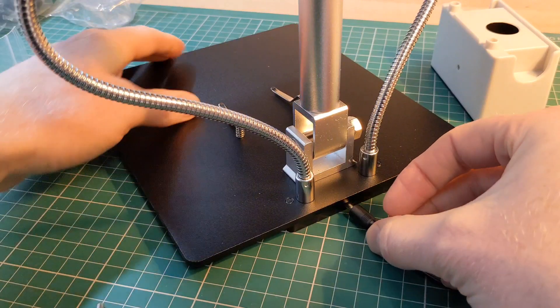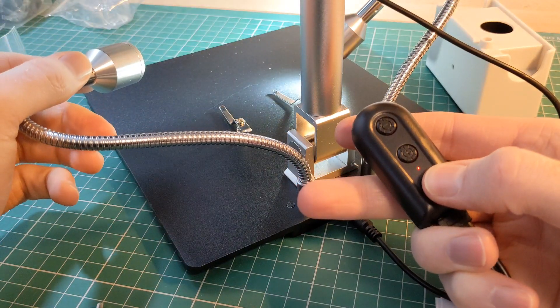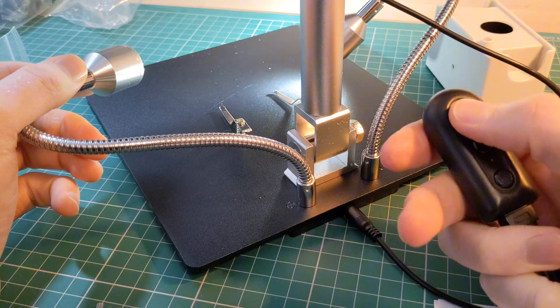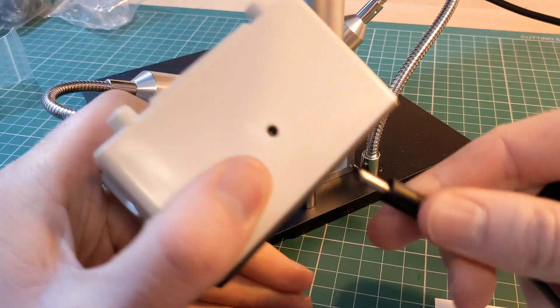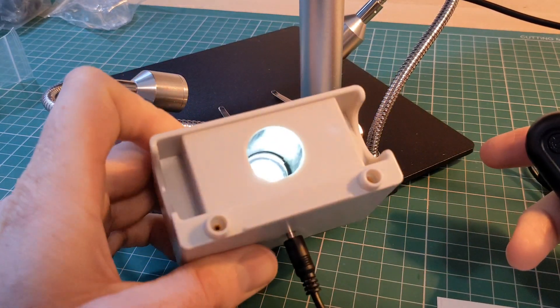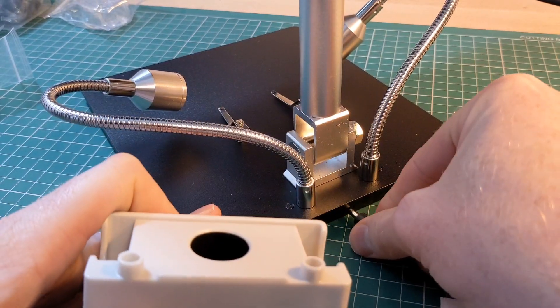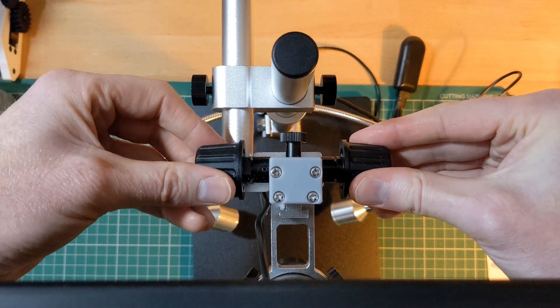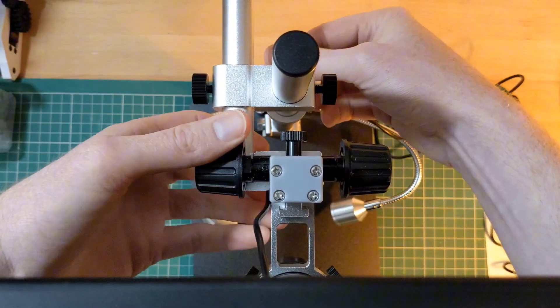Next, I connect the power for the integrated lights on the base. You can see the lights can be adjusted using the inline switch. This also powers the microscope. There are multiple controls to adjust the position of the microscope, including fine control and focus.